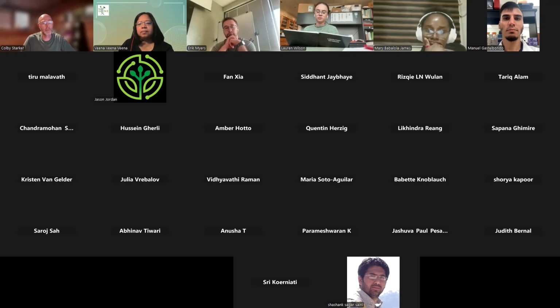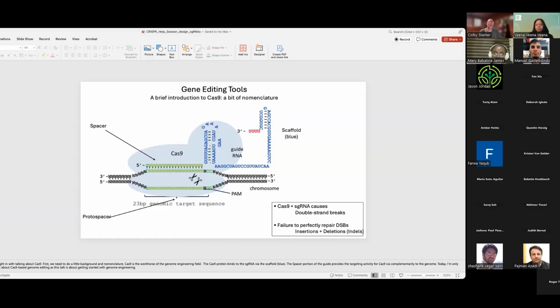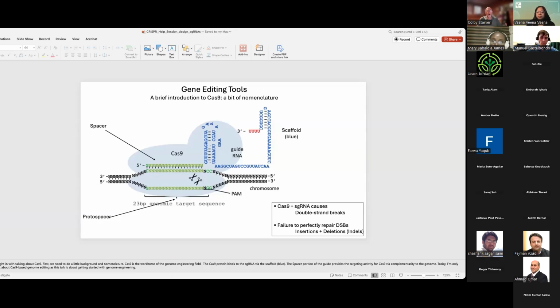Typically, and probably for the purpose of this presentation, most of the things that we're going to address are going to talk about knockouts. So basically, simple frame shifts, which we consider to be simple kinds of edits. Basically, what I do if I'm trying to make a knockout is I usually design two guide RNAs for the same gene that are in the coding sequence, somewhere in the 5' end of the gene, or will hit an area of the gene that is known to be extremely important for function. So those are the first things that I look at.